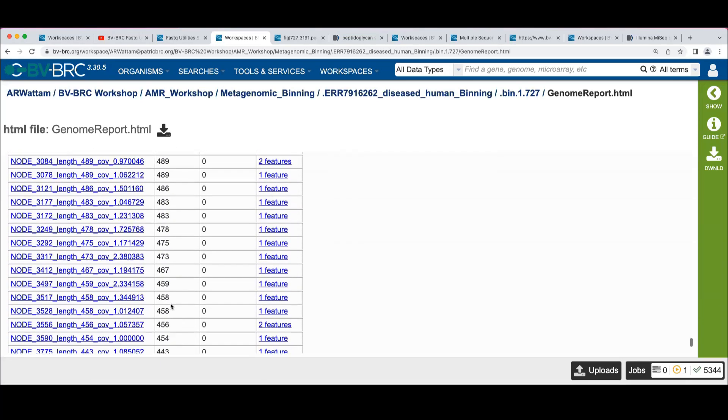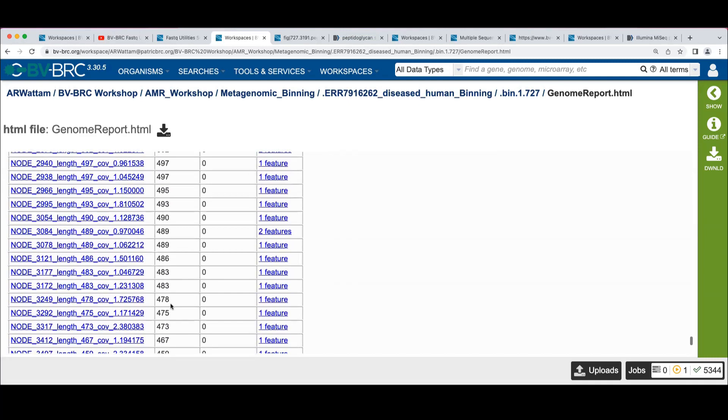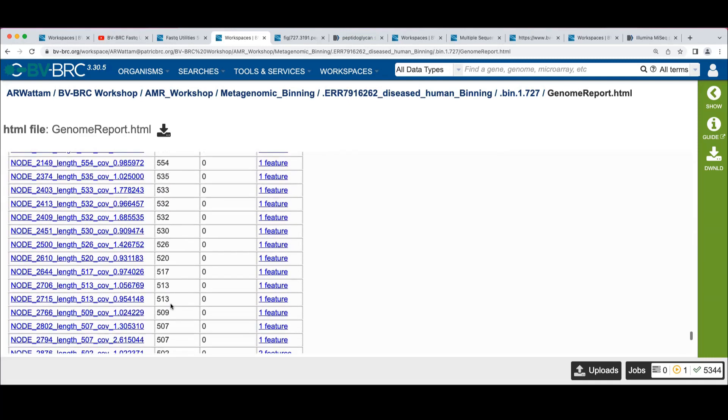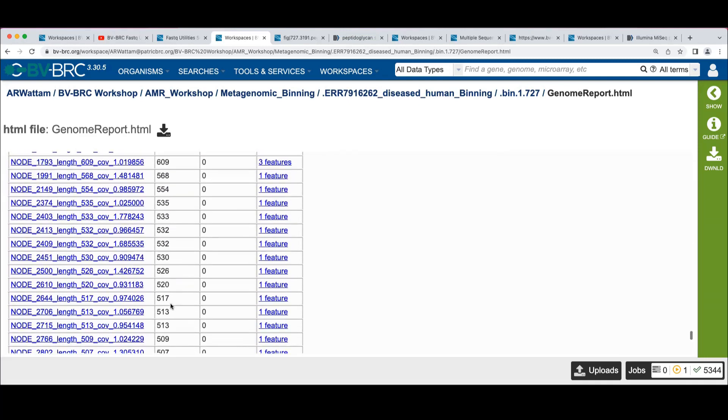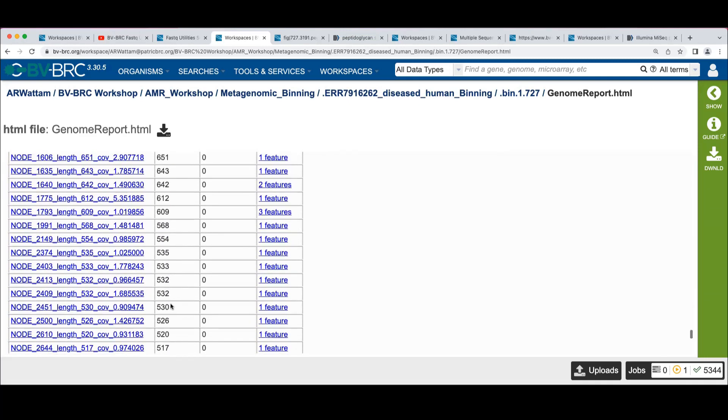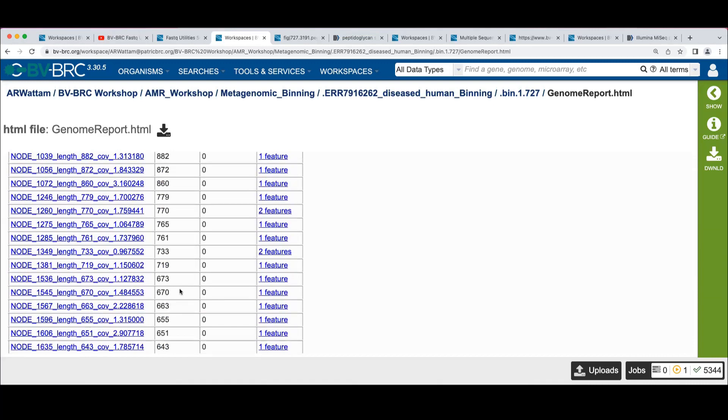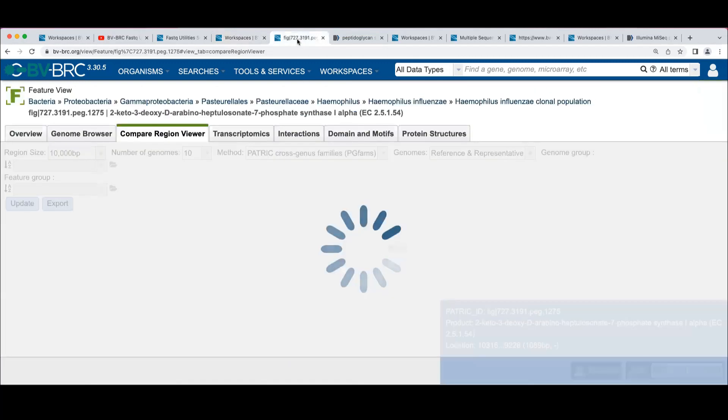So these guys may all be a little bit questionable, right? These are all 400 base pair contigs, which isn't really long enough to do much of anything. Things to contemplate while you're looking at the data.